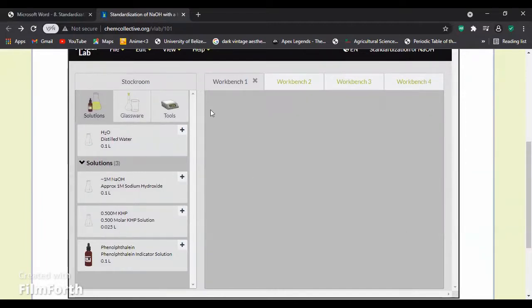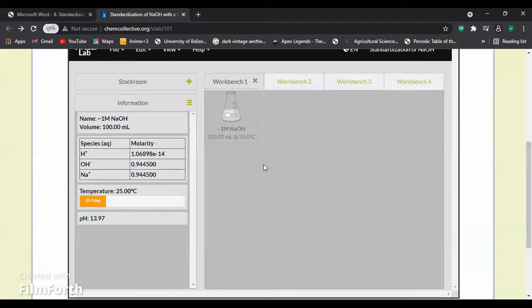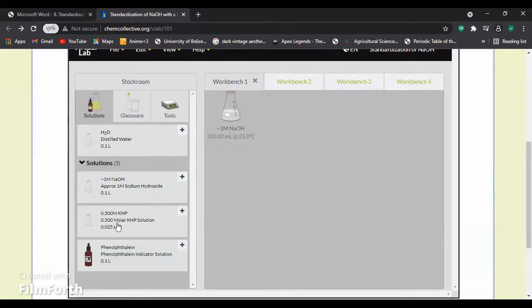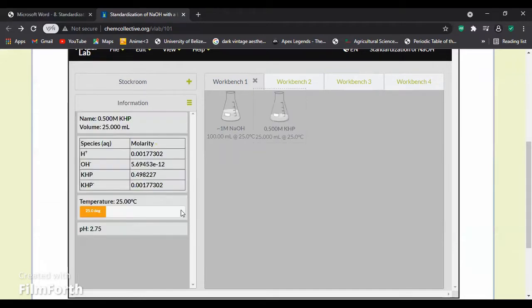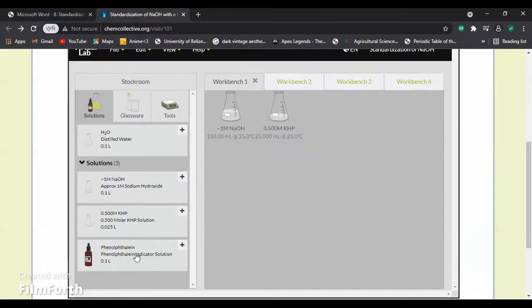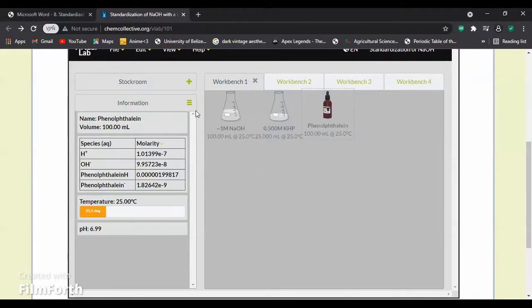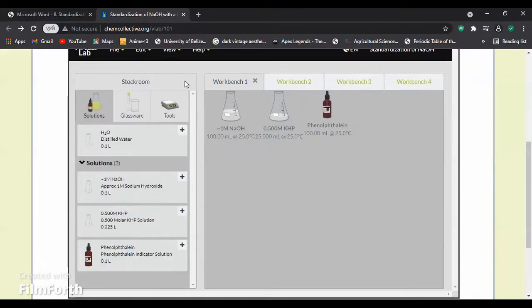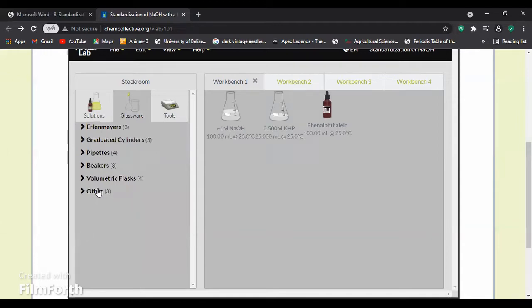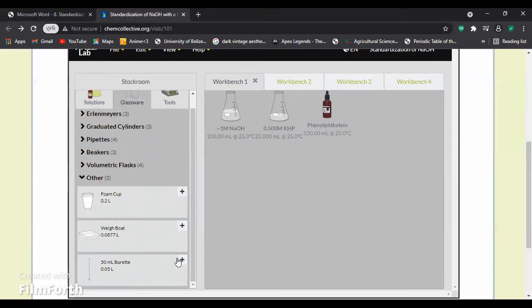We will now gather our materials, which is 1 molar of NaOH, 0.5 molar of KHP, and the indicator which is phenolphthalein. And we will also need a 50 milliliters buret.